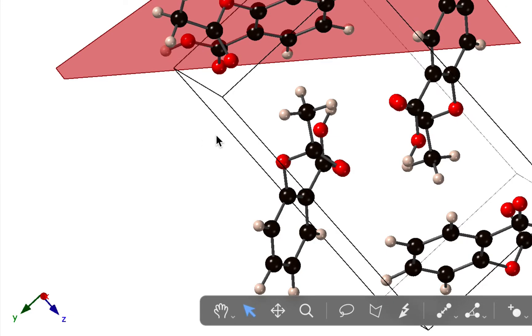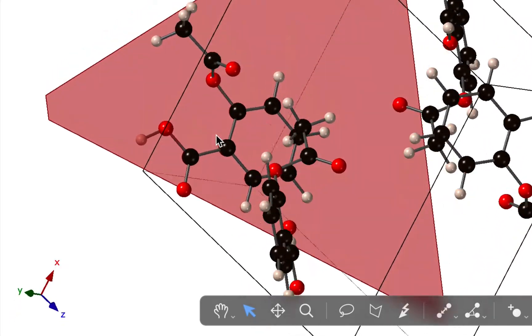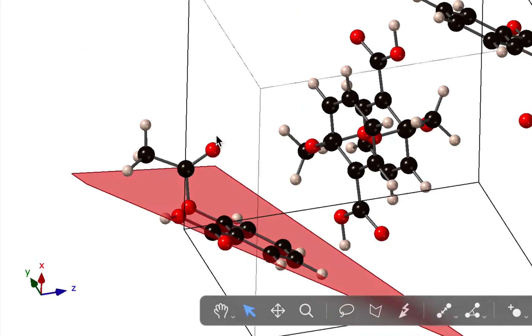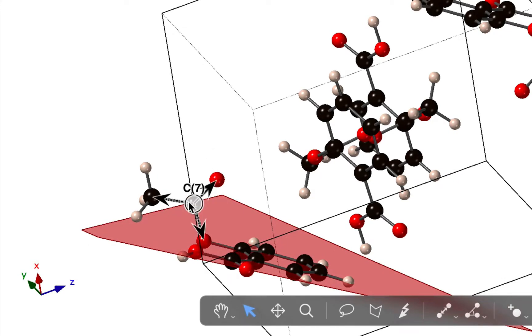Now let's rotate this slightly. For this particular molecule that's of interest, I have some atoms that are outside the plane. Let's take the C8 atom. I might be interested in the distance from the C8 atom to the ring.